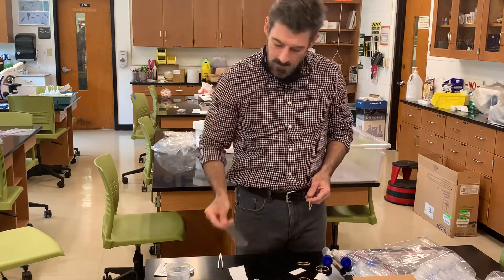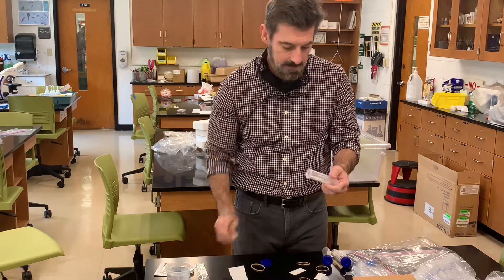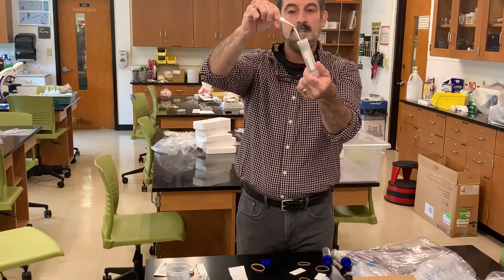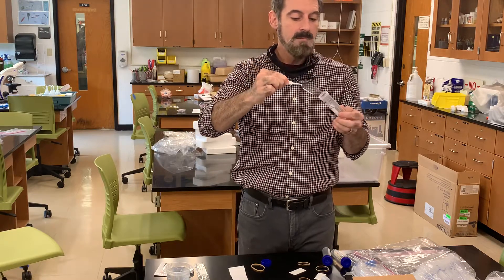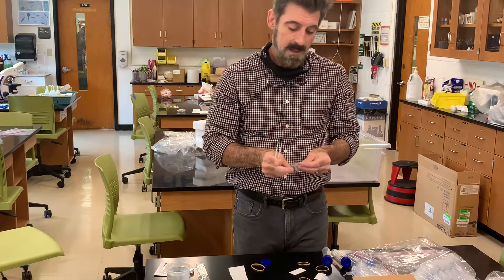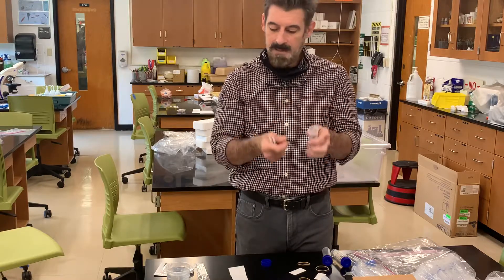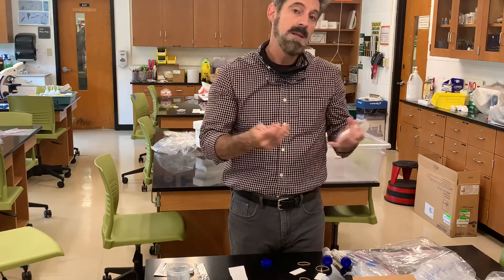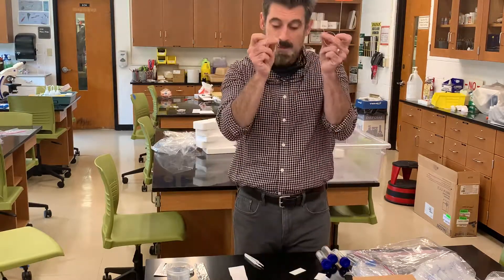There's going to be a ruler in here that you'll use for one of the labs. There's also dialysis tubing in one of these containers — it's thin, totally transparent tubing used for our osmosis lab. In that lab you'll make up different molar solutions, pipette them into little dialysis bags, seal the bags off, weigh them on your digital balance, drop them into water, wait, and then re-weigh them to see if they change over time. There are also little rubber bands in the kit that you'll need for that lab.